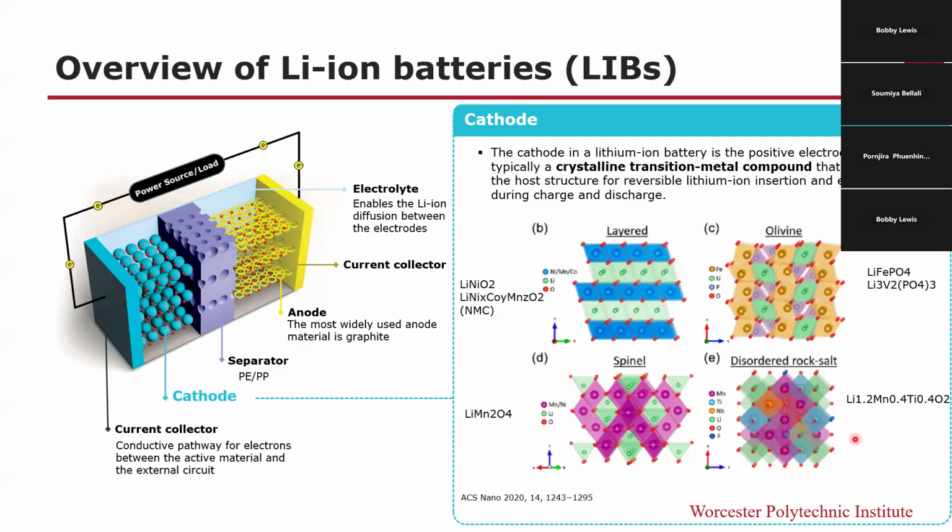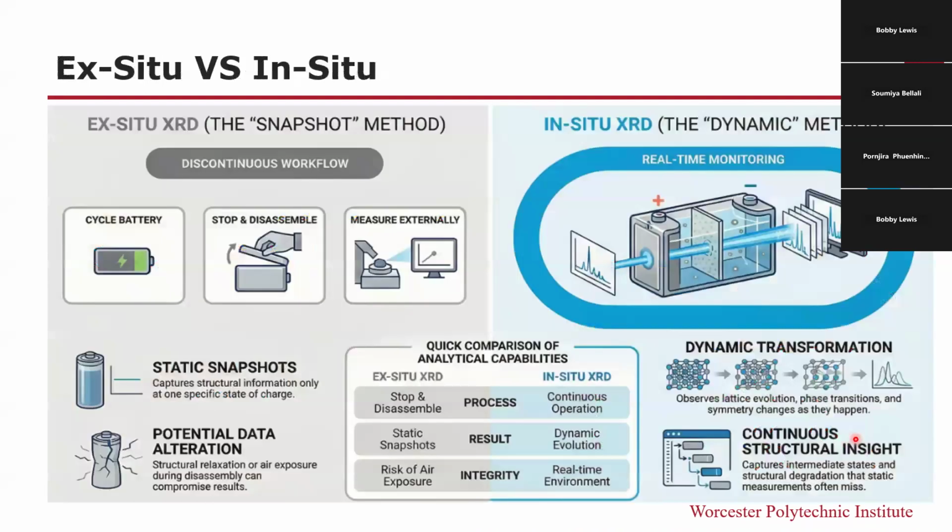clearly defined. And so, during battery operation, these crystal structures do not remain static. They undergo lattice changes, phase transition, and sometimes symmetry modification. So, we can study those structural transformations using ex-situ and in-situ XRD.